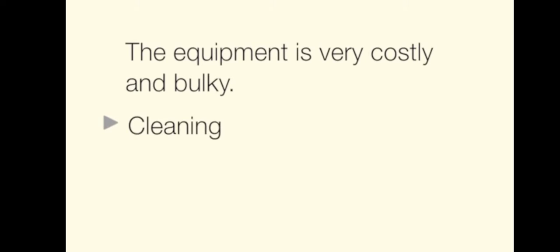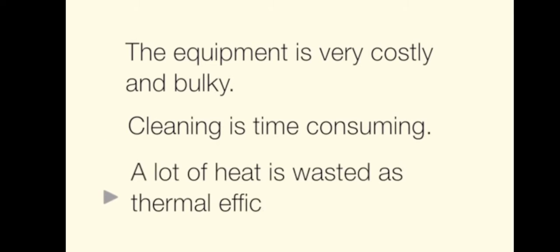The disadvantages of the spray dryer are, the equipment is very costly and bulky, cleaning is time-consuming, and lastly, a lot of heat is wasted as it has low thermal efficiency. An example of industrial application is the production of orange juice.